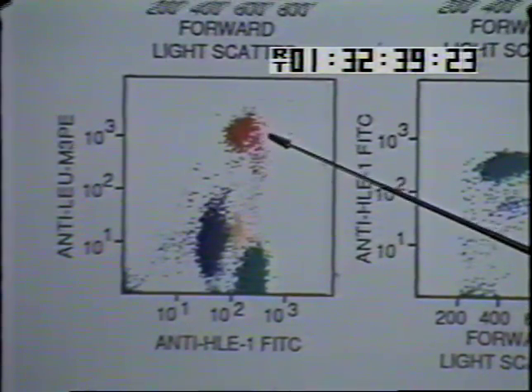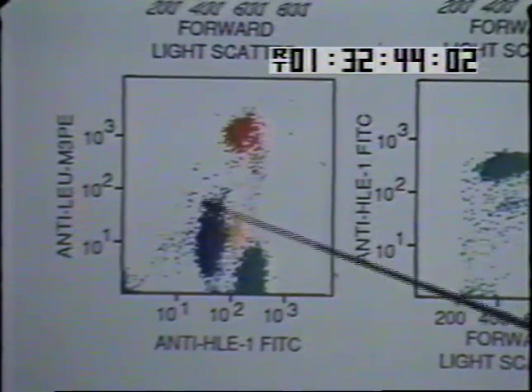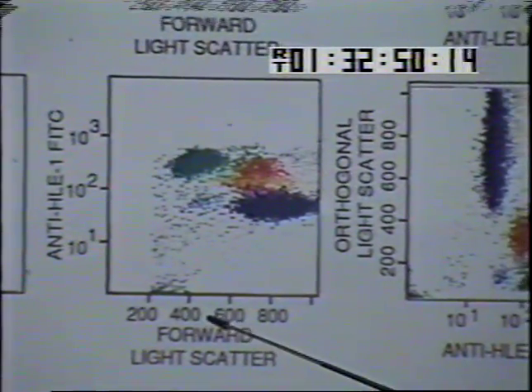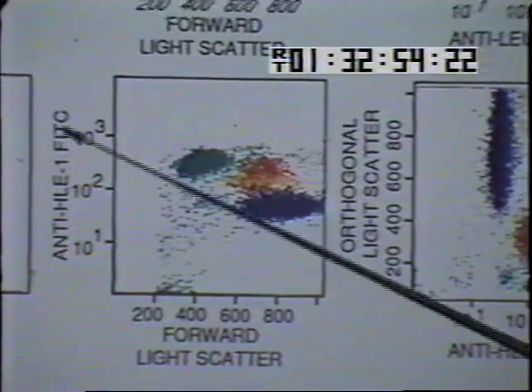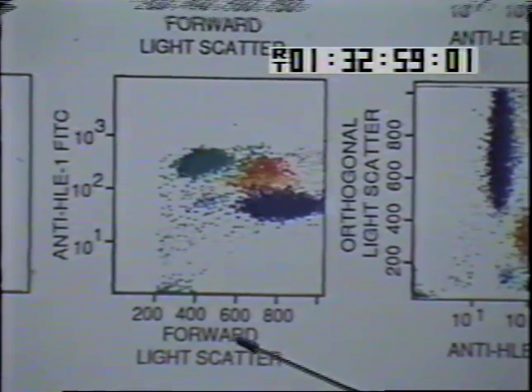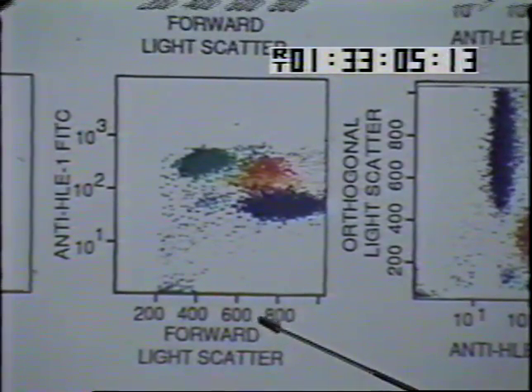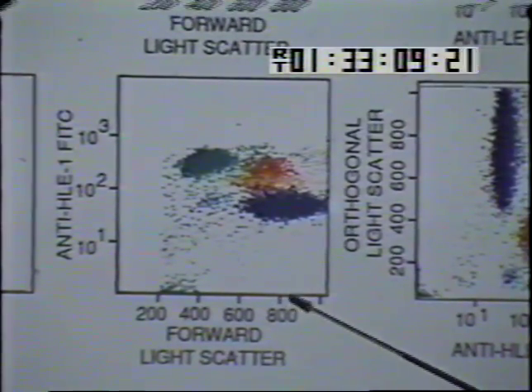Notice how each of the different cell lineages or types has a unique address or space in each of the graphs. One can move and put combinations of physical properties, in this case size, versus fluorescence property. So this panel of 6 images represents the multiple and multi-parametric measurements which are possible with a flow cytometer. And each image tells us something unique about the cells being studied.